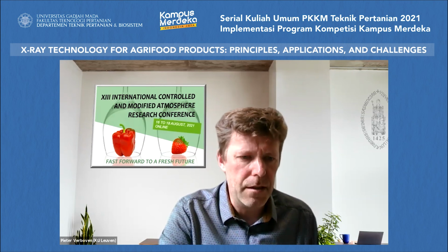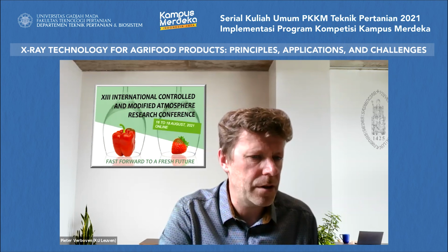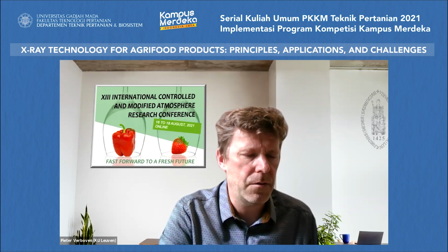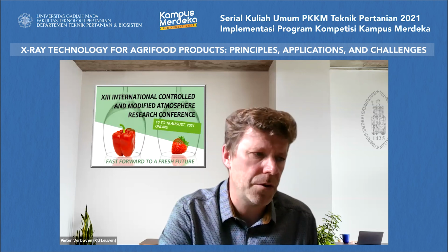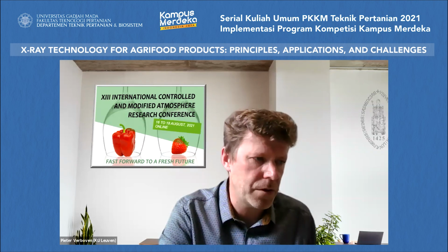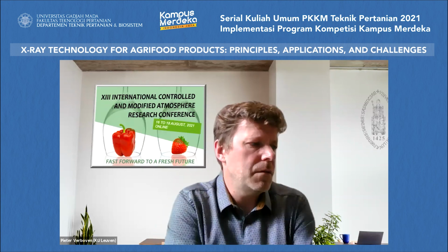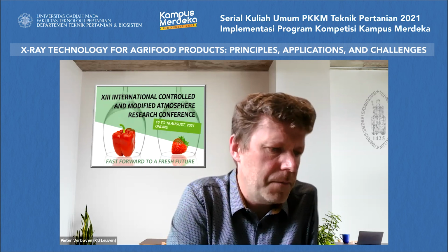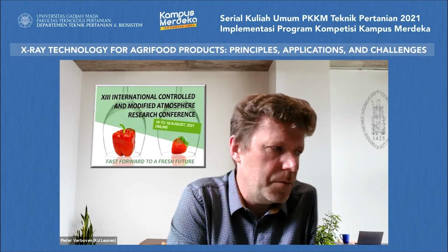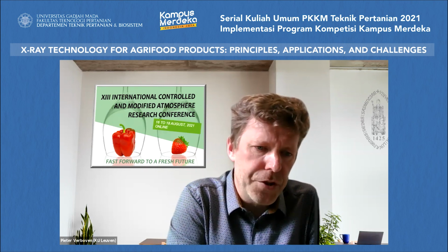And then it automatically processes those images with deep learning algorithms to generate the morphological characteristics. And then, of course, the company knows which morphological characteristics are important for the application, so they can take it from there. That's an application we have developed from scratch for them, using a commercial desktop X-ray CT imaging system, which you can buy from multiple companies.